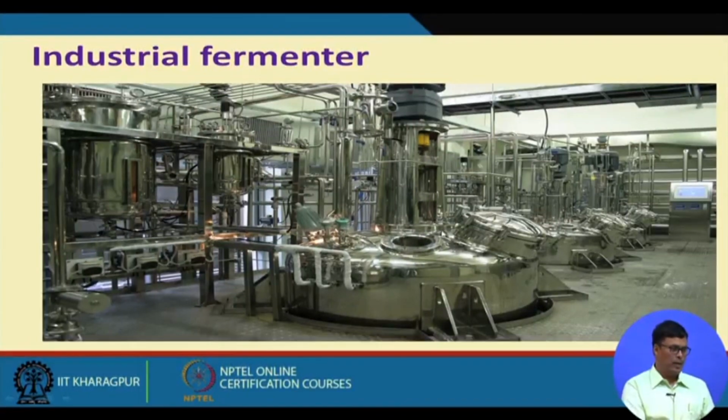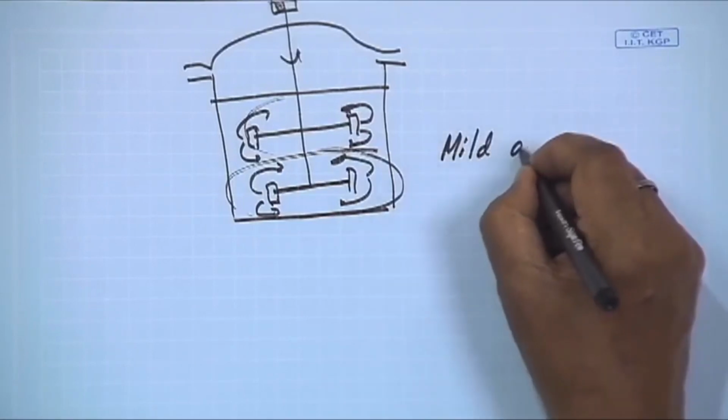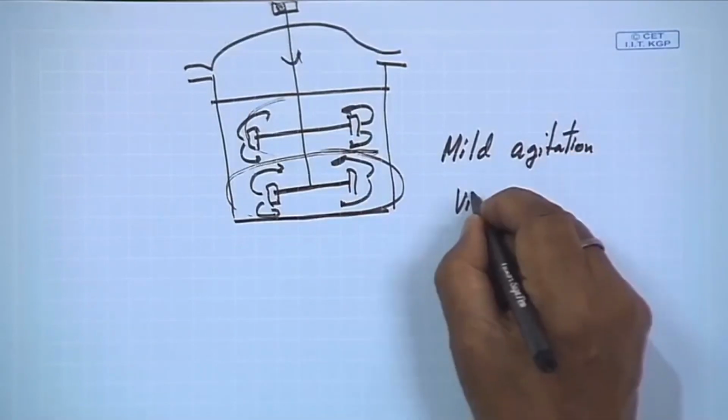Now here I want to point out the power requirement for mild agitation and vigorous agitation.